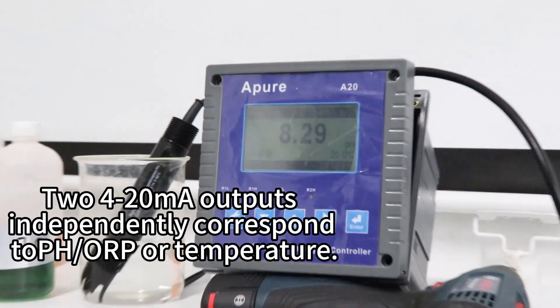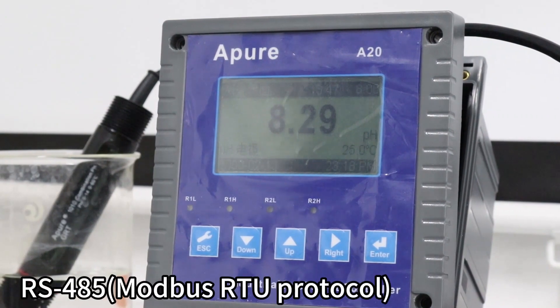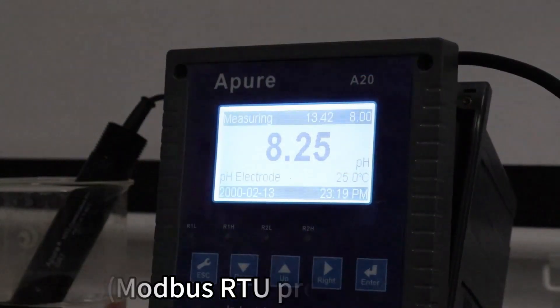With 2 independent 4-20mA output channels corresponding to pH, ORP, or temperature parameters, it ensures that you have real-time access to critical data in your production process.